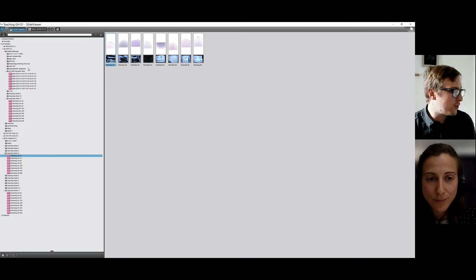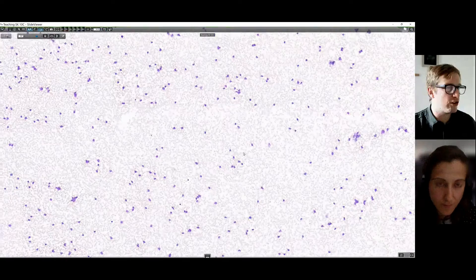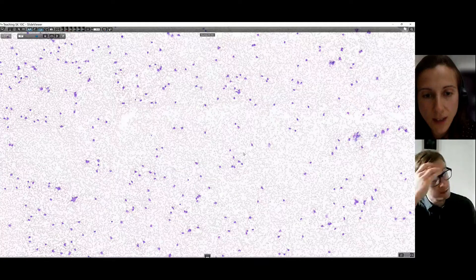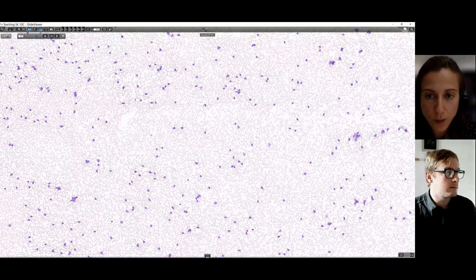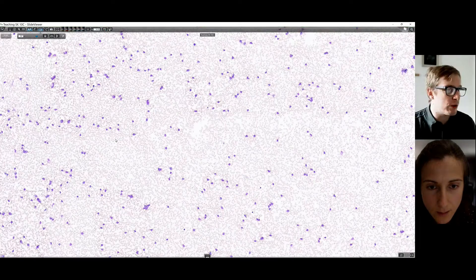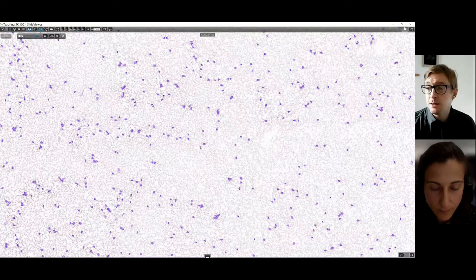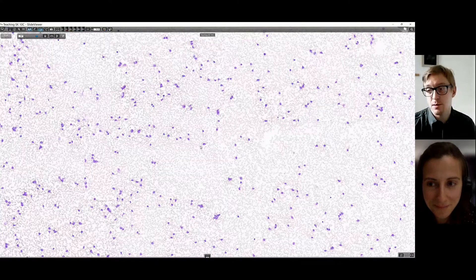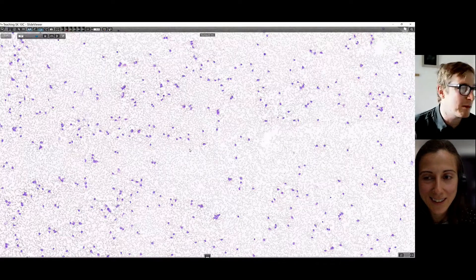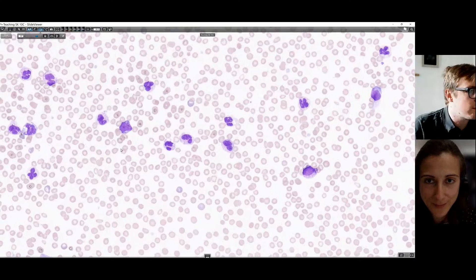Moving on to case three. Again, low power - what's the general impression? There is leukocytosis, quite high this time compared to the previous one. And again, even more so than the last one, there is more anaemia - the red cells are more spaced out. We have automated machines which tell you haemoglobin, but you get an impression of anaemia from the film as well. So we're going to scan down at some of these cells.